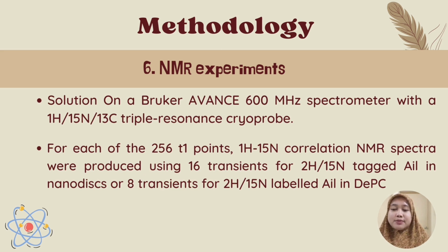on the 500 and 700 MHz spectrometers. 1-dimensional 13C and 15N spectra were recorded using the CP, which contained a contact period of 500 microseconds or 2 ms for 1H-13C or 1H-15N and a TPPM sequence for the 1H decoupling.